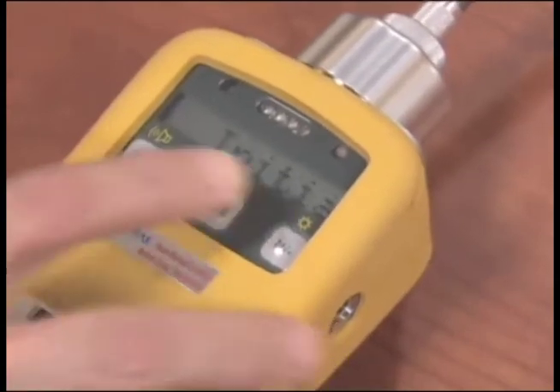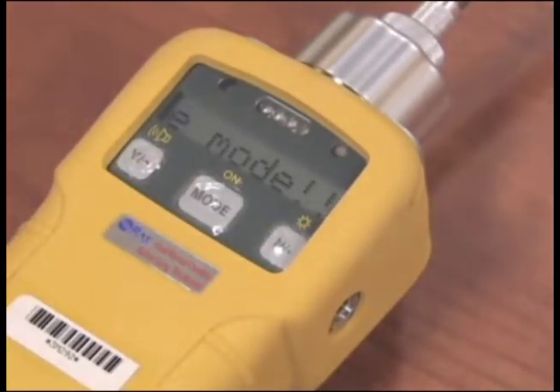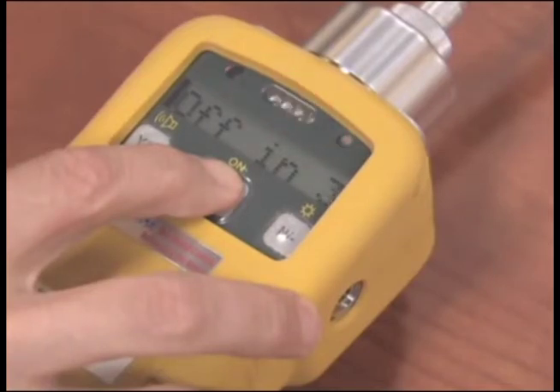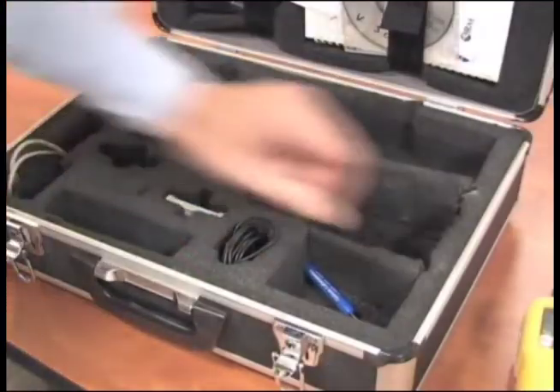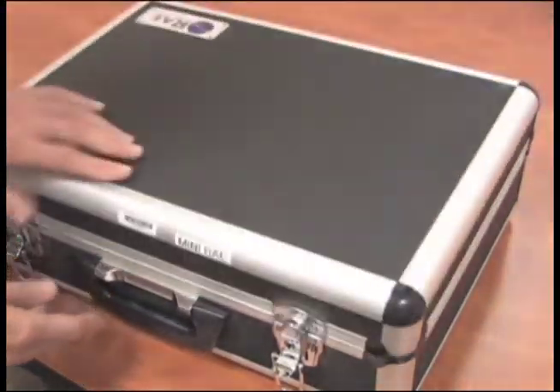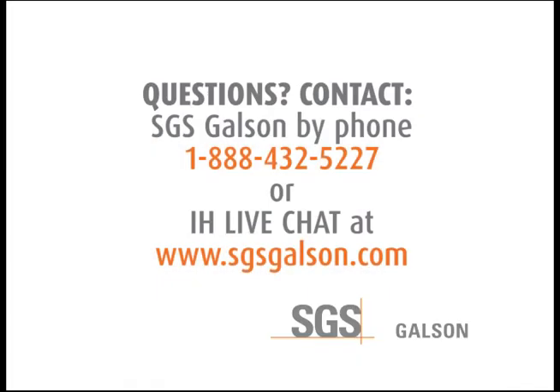Push the Mode button once on the unit to go back to the Survey mode. Hold the Mode button for 5 seconds until the unit turns off. Repack and ship back to Galson Laboratories. Questions? Contact SGS Galson by phone or IH Live Chat.